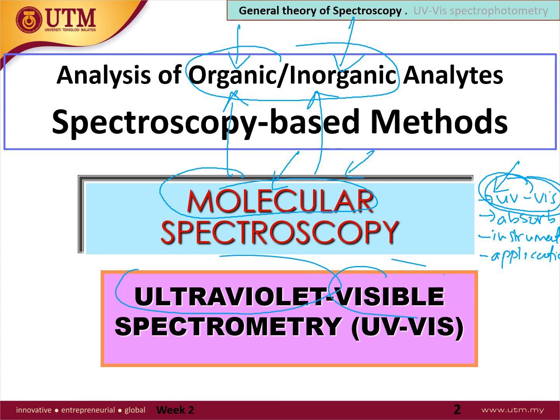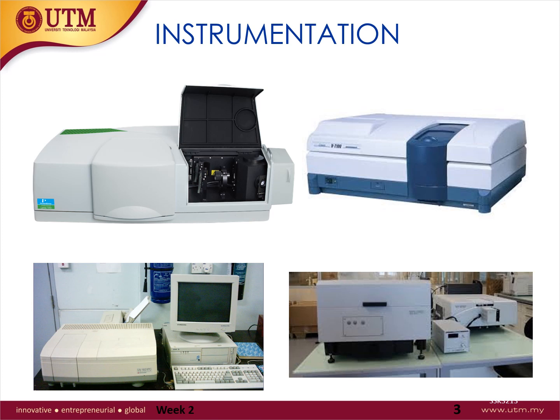We will go and understand what kind of interaction, for organic compounds, enables them to be absorbed. But first, before that, UV visible spectrophotometry is an absorption spectroscopy. Before this, we covered that we have absorption, and then we have emission. This UV-VIS falls under the category of absorption.